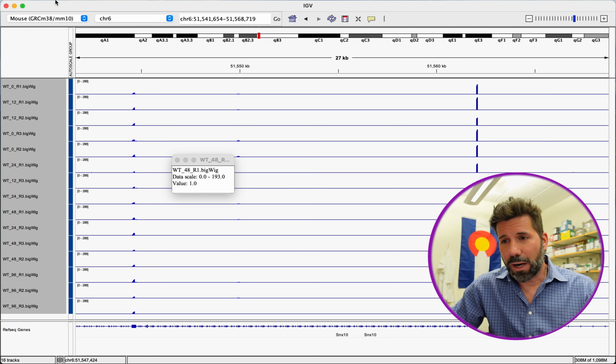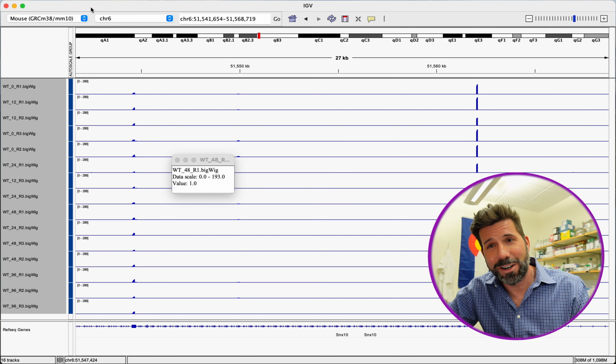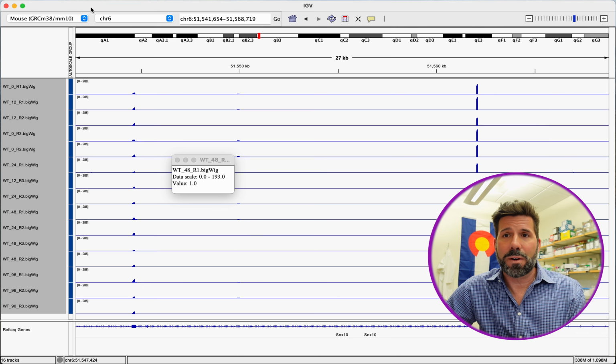So congratulations, you've finished all of your visualization exercises and can make heat maps and line plots. You know the difference between TPM and count plots. And now we are ready to end our RNA-seq journey. And I think you're at a really good place knowing some basic R fundamentals, where you can start to use ChatGPT to type in some code and say, hey, now I want to do this. Can you help me do that? I find it's a really helpful resource, but you have to know the fundamentals first.